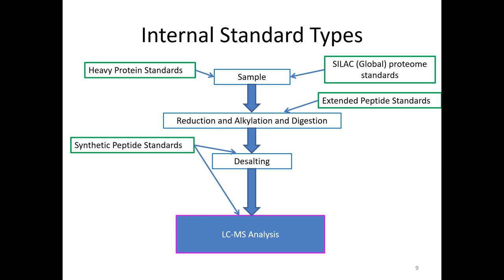They're cultured with heavy amino acids. Right, so they can be grown in culture and expressed by whatever organism with heavy media. So I think the less expensive way is having uniformly incorporated N15, because I think it's like, do you know, Andy, how they do? Is it like glucose, heavy glucose that they put into the media? Right. So when they're grown like that, then every nitrogen in your protein has N15 or is supposed to.